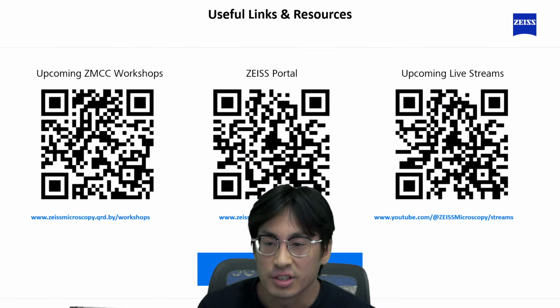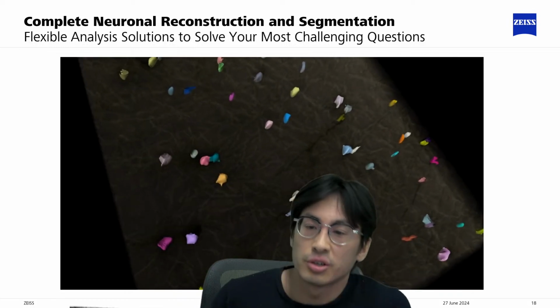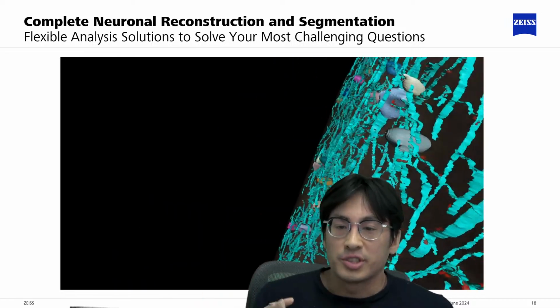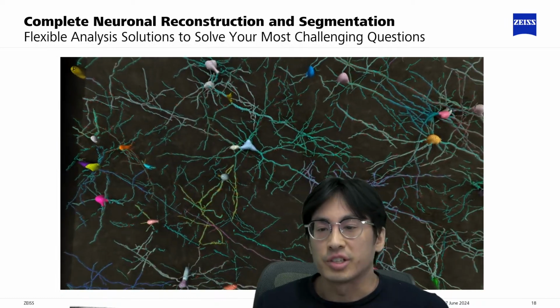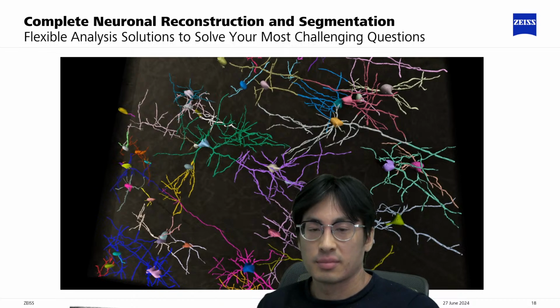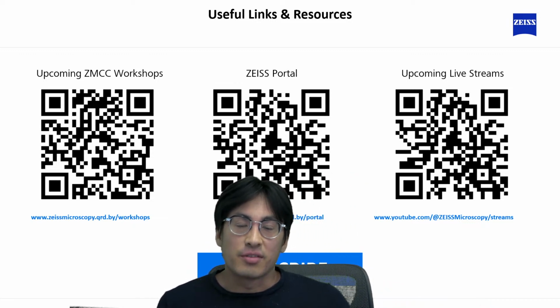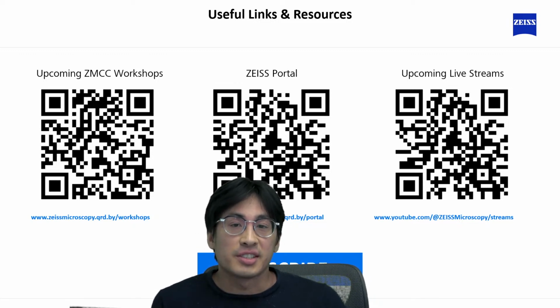And as this video shows, you can segment your soma, your neurites, and transform all your objects into neuronal traces as your reconstruction. Okay. So that was a quick live demo of our arivis software for neuronal reconstruction and segmentation.